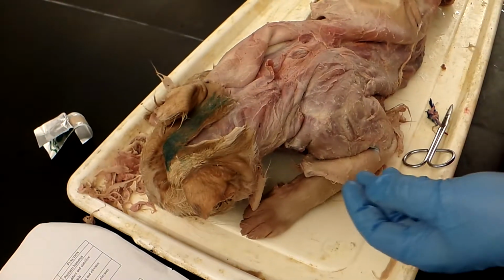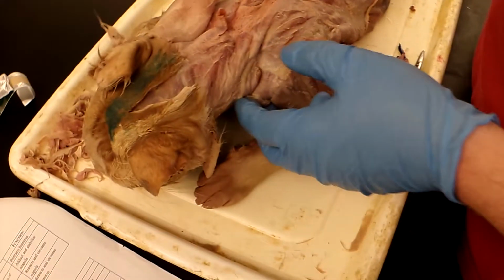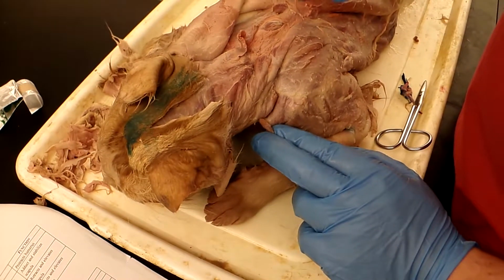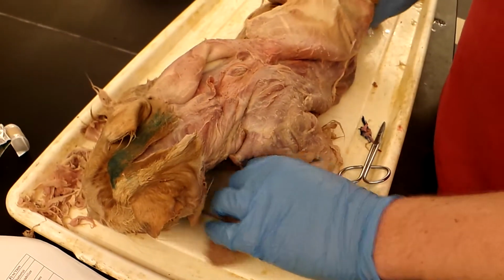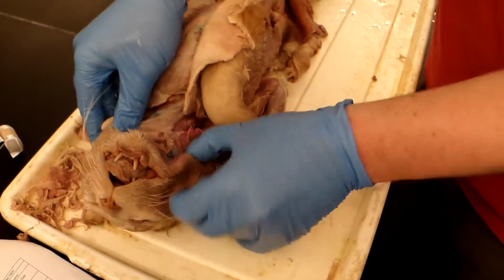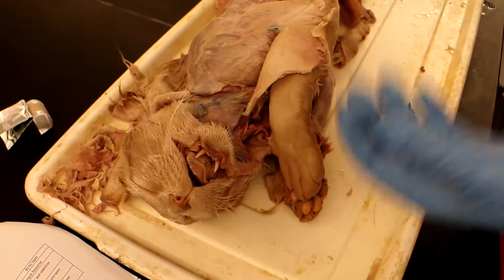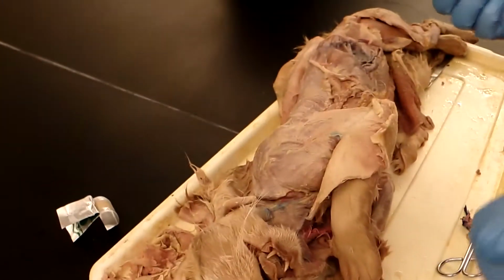Finally, the digastric is located on the bottom, so I gotta flip the cat over one more time. And it is located right here. The origin is the occipital, the insertion is the mandible, and the function is that it depresses the lower jaw.